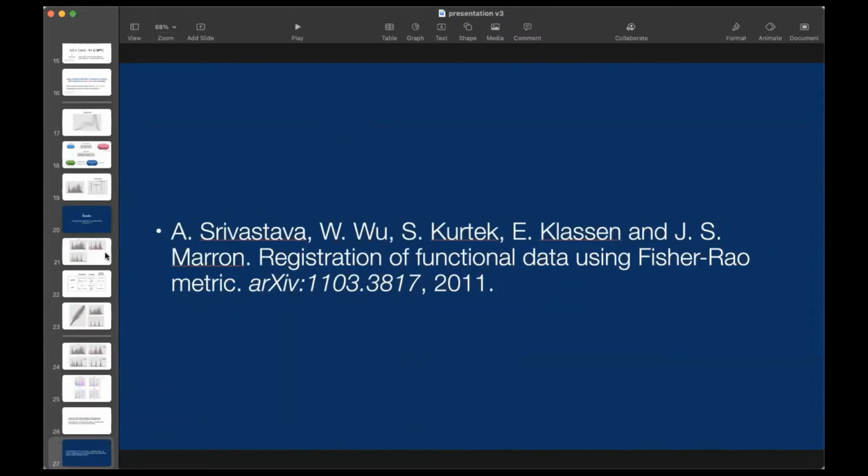Thank you. I was just wondering, is this written in R, the routine? So the routine is currently written in R, Python, and MATLAB. There's been a number of libraries written across multiple software packages. For the figures in this talk, the computations were done in each of R, Python, and MATLAB. Do any of the languages utilize parallel computation, or are the data dependent? I believe Python uses parallel computation, but I'm not sure if R and MATLAB do. I don't think they do from what I've seen, only Python, I would say.